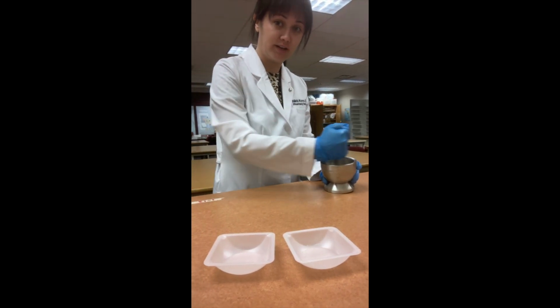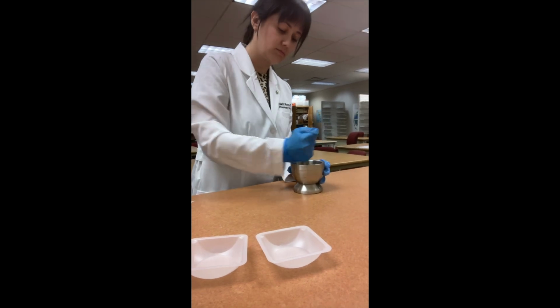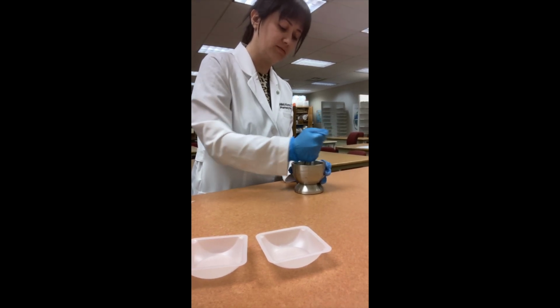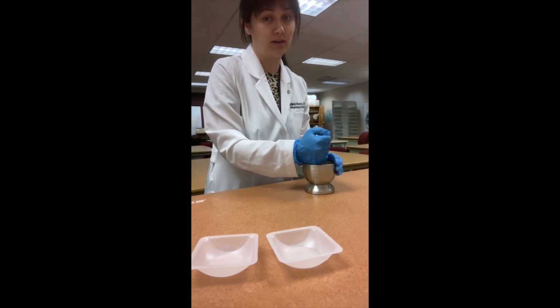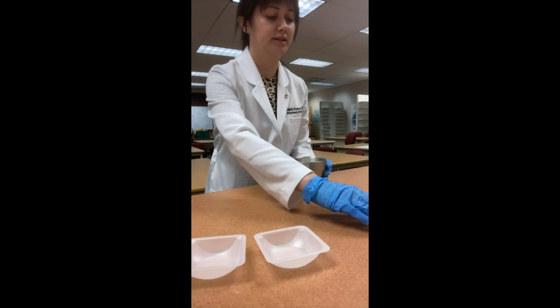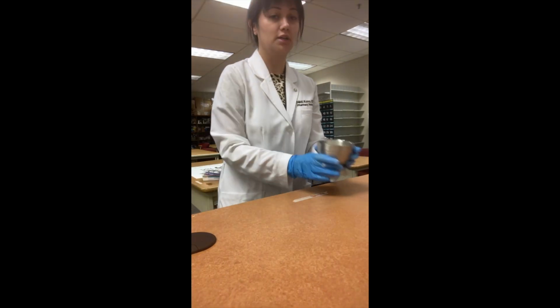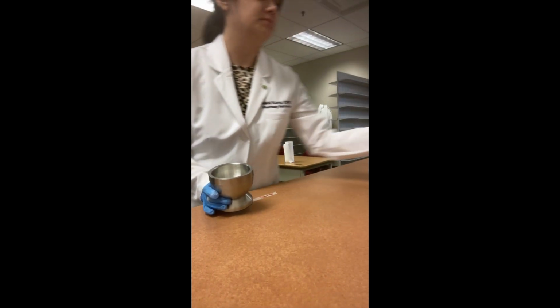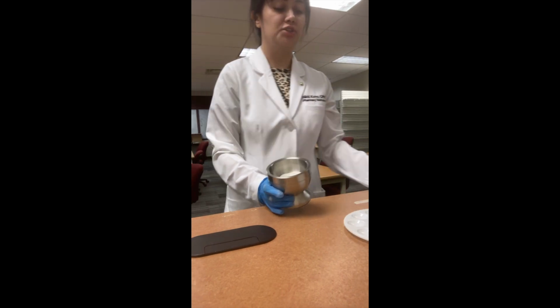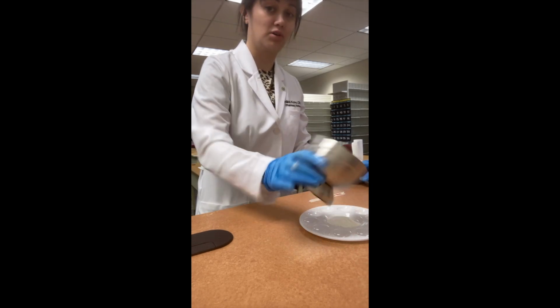So right now, as you can see, I'm really trying to grind at the sides. I'm not just kind of mixing around like this. I'm really trying to reduce that particle size. The powder is a little thicker, so if you don't really triturate well, then you're going to have a thicker paint. Okay. So now we're going to take our mixture and we're going to move to the other table. So now we have our mixture. We're going to put it in the center of this artist palette, which is going to resemble our ointment slab. And then we're going to put our mortar back.